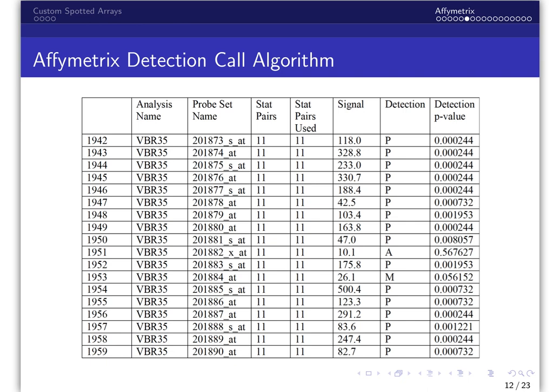The term hypothesis testing refers to the process of trying to decide, on the basis of experimental evidence, the veracity of such hypotheses. The output from the Affymetrix GeneChip operating software includes a column that indicates whether the probe set is present, marginally present, or absent in the hybridized sample.